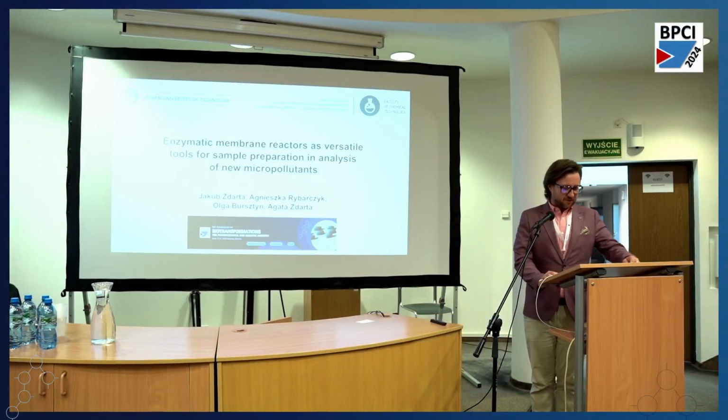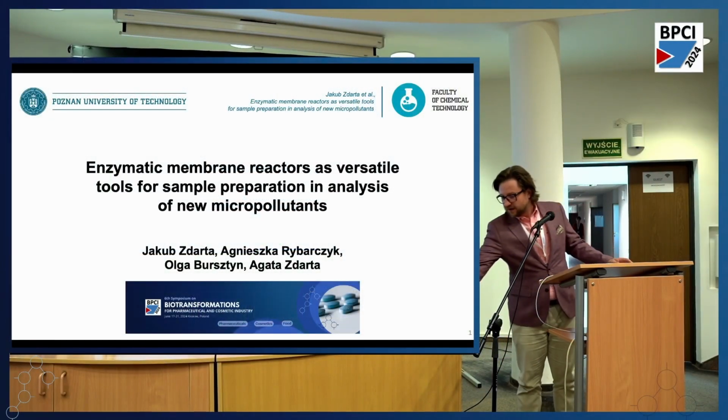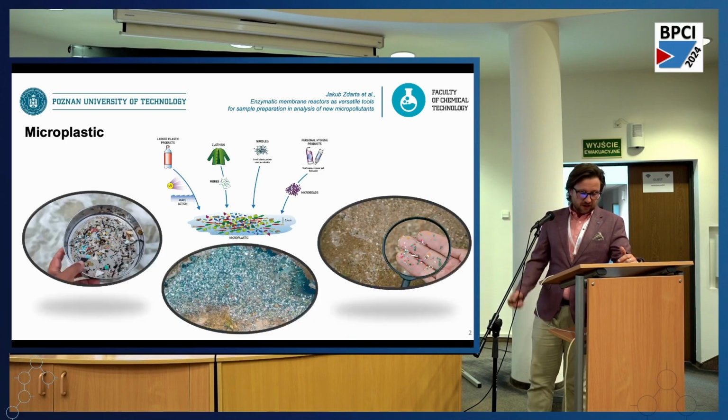Today I will talk about the use of enzymes for the preparation of samples for micropollutants analysis. But what I mean by micropollutants here is microplastic.